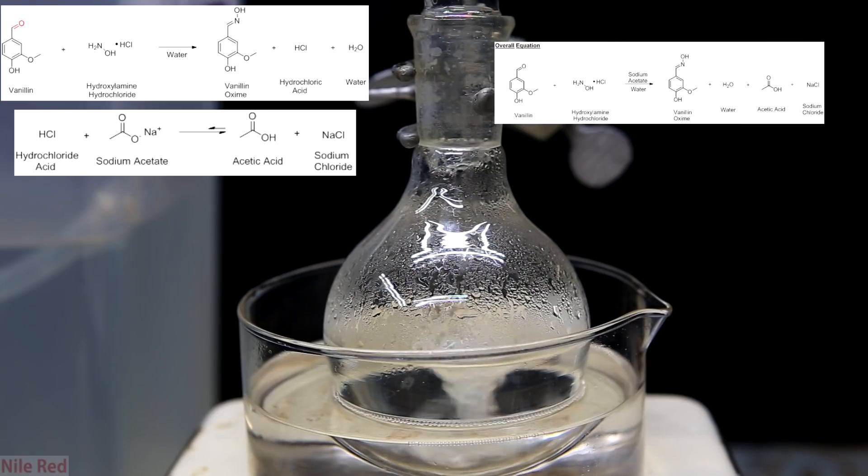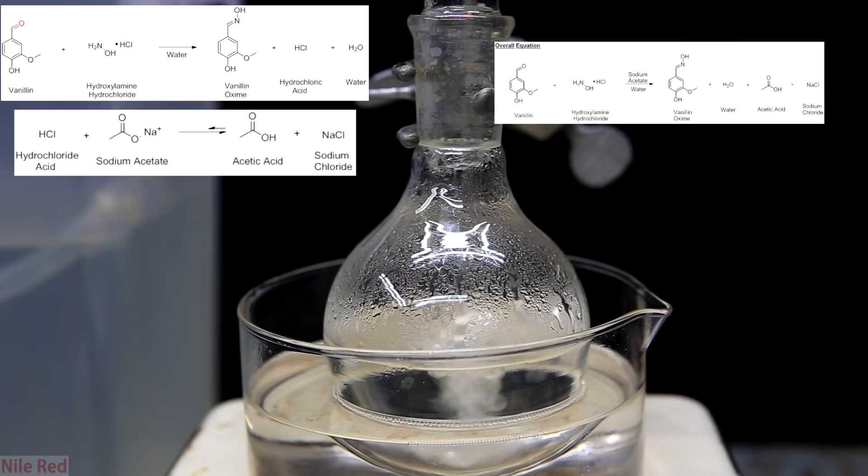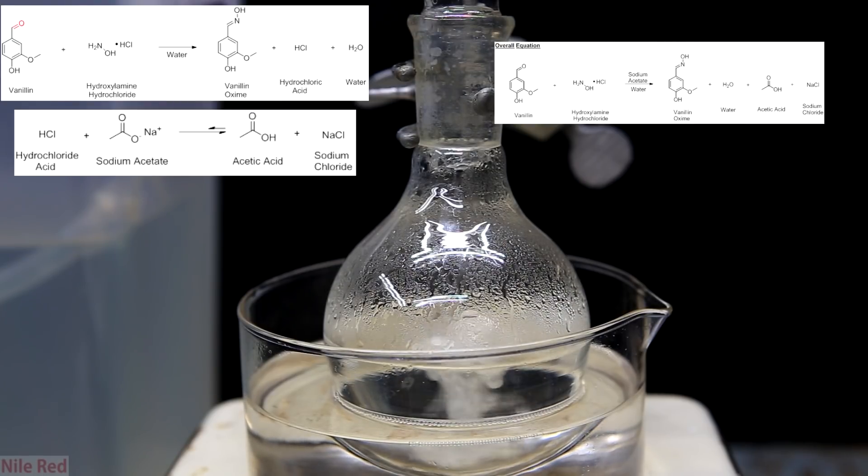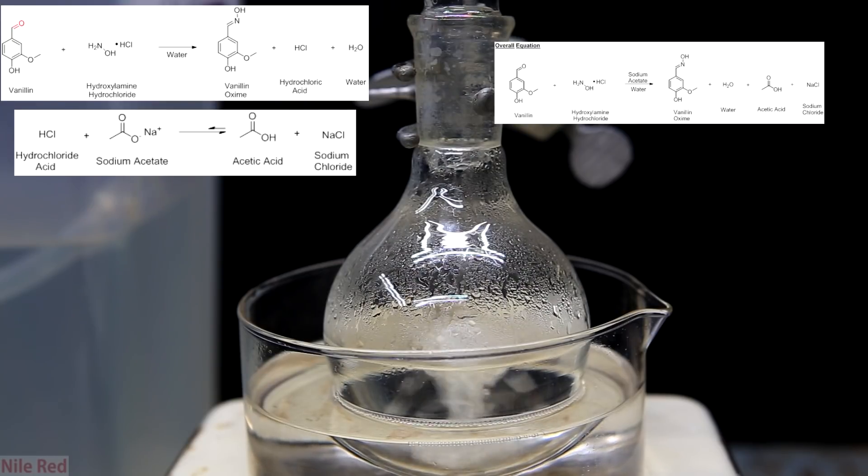When we combine these two separate reactions together we get our final equation. After all this talk about buffer solutions I should note that we could just flat out add a base and neutralize the hydrochloric acid. This procedure called for sodium acetate but there are other procedures that call for the use of the base sodium hydroxide instead.